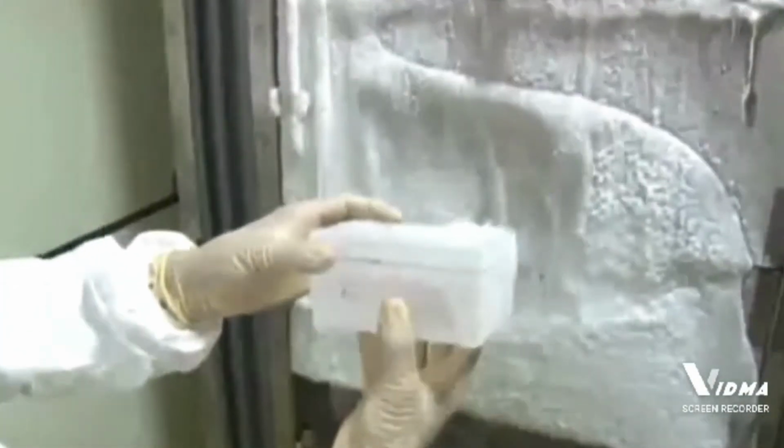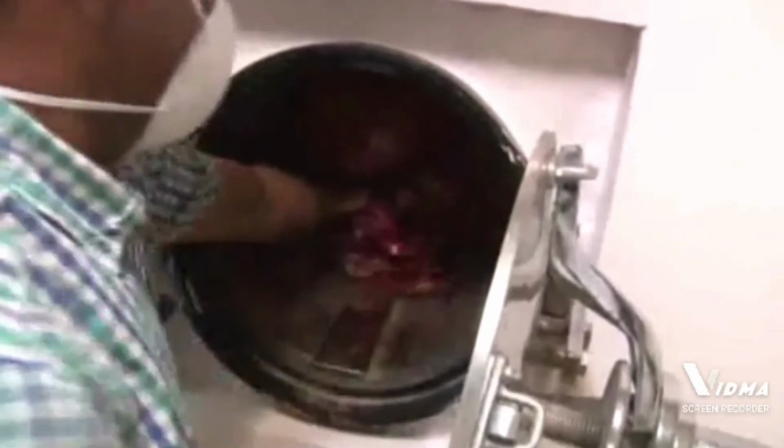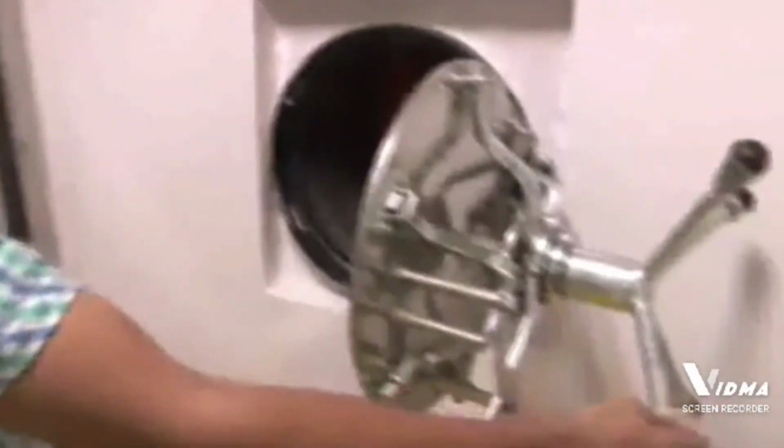Samples of the BSL-3 lab, nucleic acids, mainly DNA and RNA, must be stored inside the laboratory itself at minus 70 degrees centigrade for long-term storage and further processing, as any kind of infectious material should not be taken and stored in the general lab area. At the end, the personal protective equipment which a person was wearing should be properly discarded in an autoclave bag and autoclaved in a double door horizontal autoclave mounted in the BSL-3 lab, and after autoclaving it should be completely burnt out.